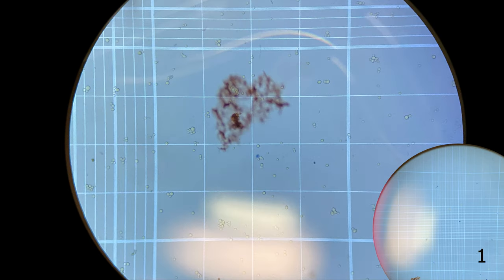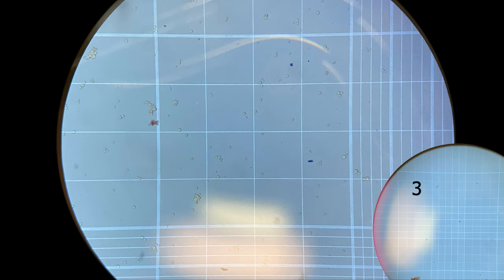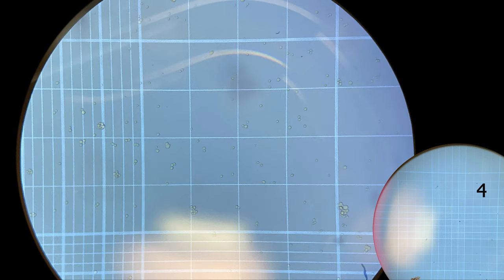We'll now count five squares on the other side. So here is the bottom right corner, 103 live cells, one dead cell. You can also see some fluff from the Kim wipe on here. The bottom left corner, 90 live cells, no dead cells. We now move to the top left corner, I see 82 live cells and one dead cell. In the second one from the top, there's a dead cell. We move to the top right corner, 77 live cells I saw here. And finally, we move to the middle square, remember it's 25 by 25, and here I see 56 live cells and one dead cell.